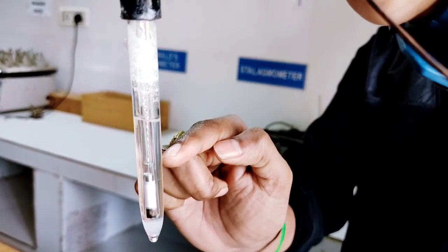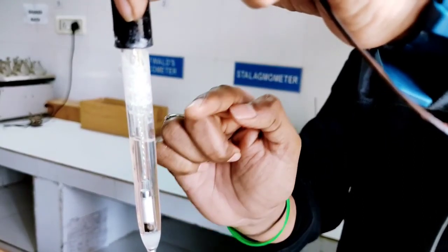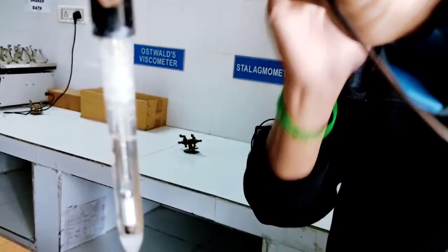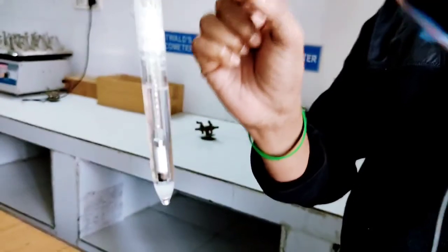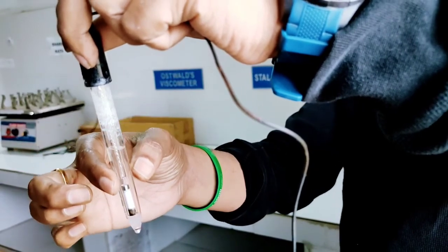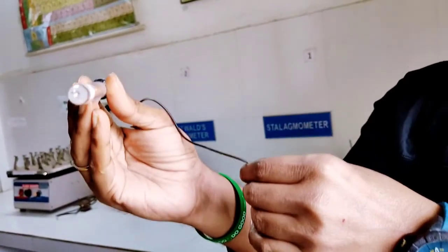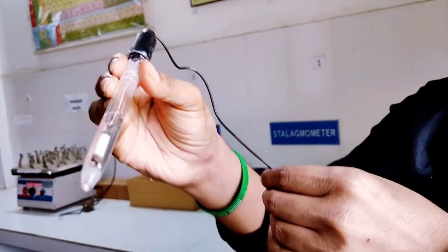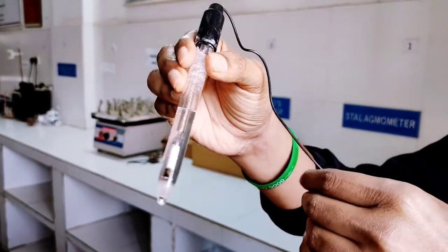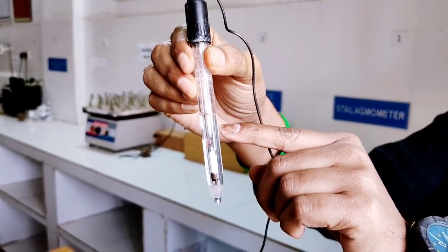So since this particular electrode utilizes calomel as one of the components, this particular electrode is called the calomel electrode. Now we have to discuss why it is called saturated calomel. Because if we see the external glass tube, the outer glass tube contains the liquid. You can see the liquid. The liquid present inside this outside glass tube is nothing but the saturated KCl solution.